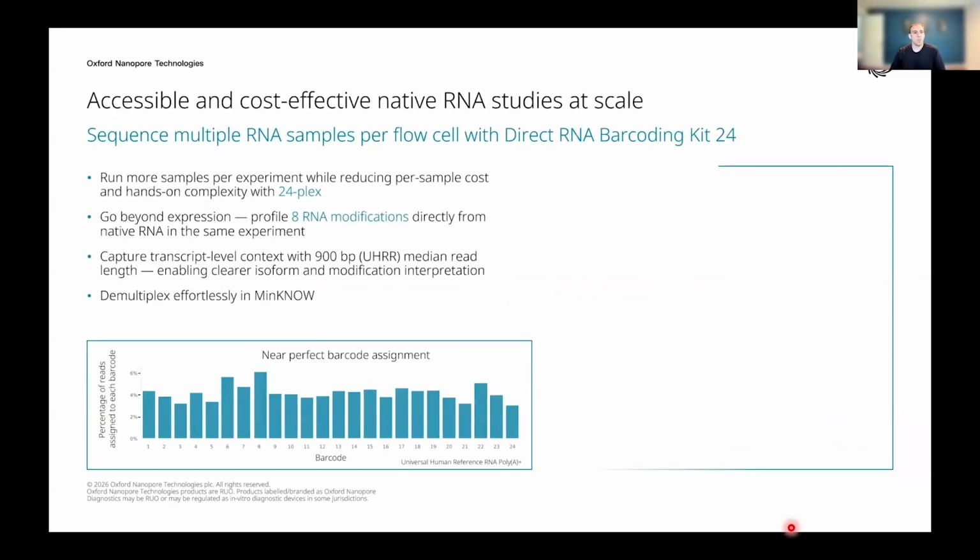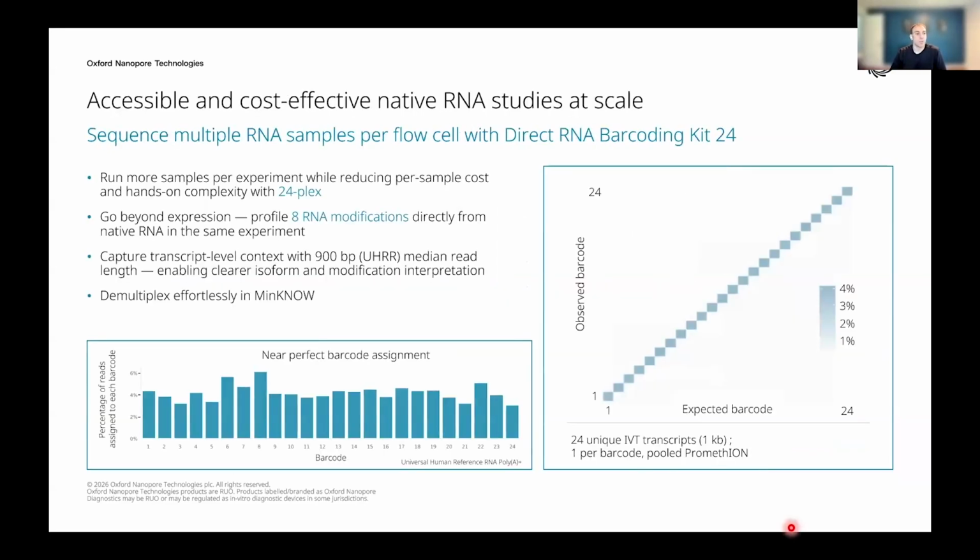The second update that we made very recently focuses on direct RNA sequencing. So as I mentioned at the beginning, direct RNA sequencing is quite unique because we're actually sequencing the native RNA molecule itself. It's going to pass right through that nanopore.